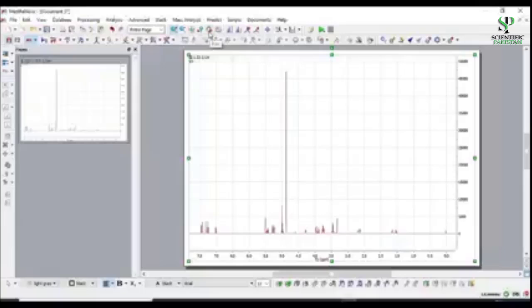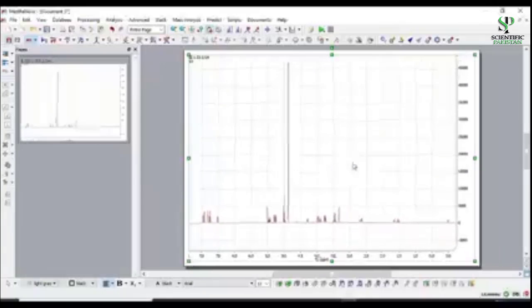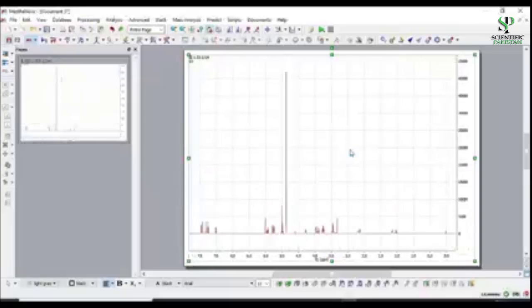here you can pan it. You can bring this baseline up here or down there by using this pan option. Let me click it, and you can see it goes up and down, right, when you drag it. So we don't want that. It's perfectly set here.